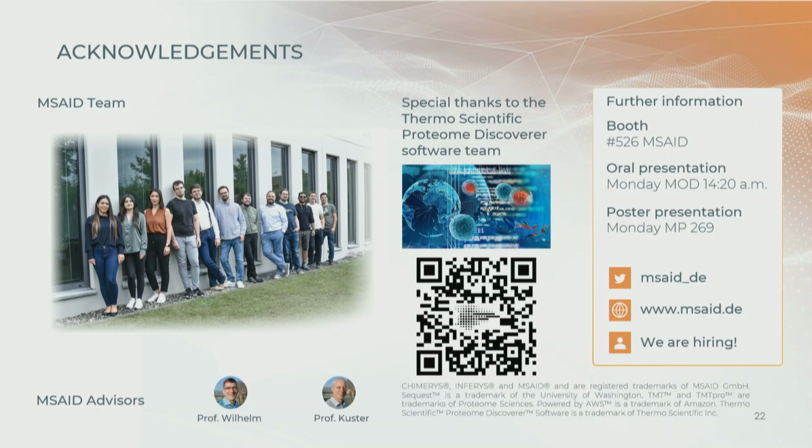Thank you for the talk. It was very interesting. Have you compared your ML-based approach to simpler, like top-end methods that seem to perform quite well? Is there an advantage there from your machine learning, or is that just something that's able to compress the search space so you save a little money on Amazon? Can you maybe rephrase the part with respect to simpler top-end methods? I'm not really sure to which you allude. So you present this kind of black box AI that's taking these highly multiplexed spectra and assigning multiple peptides within them. Mm-hmm. And there are techniques out there where we search the precursor against a list of fragments, and we get very good IDs without machine learning.